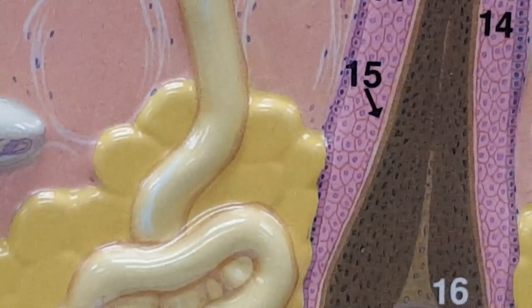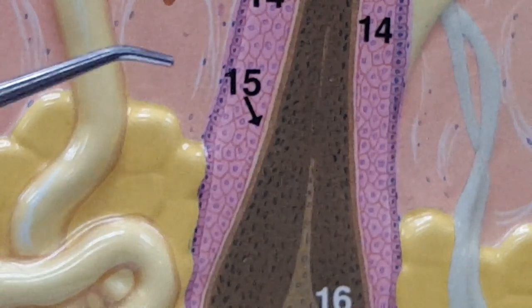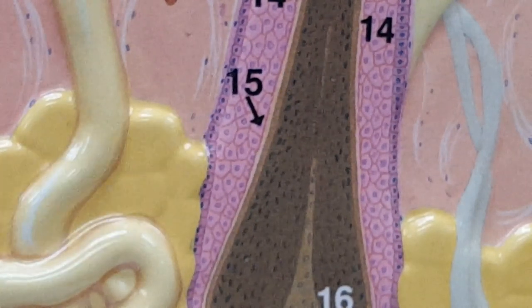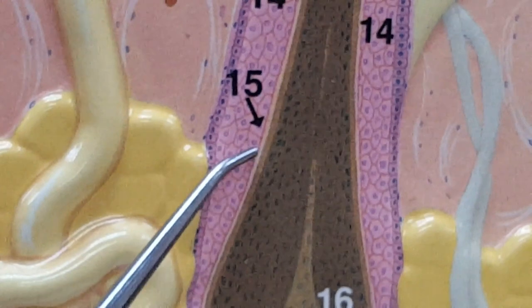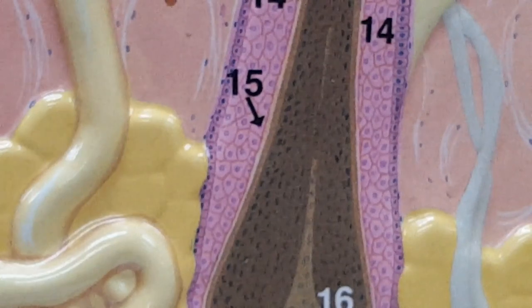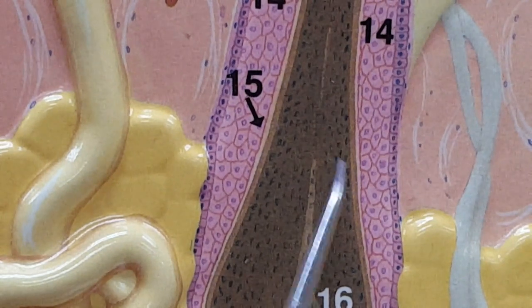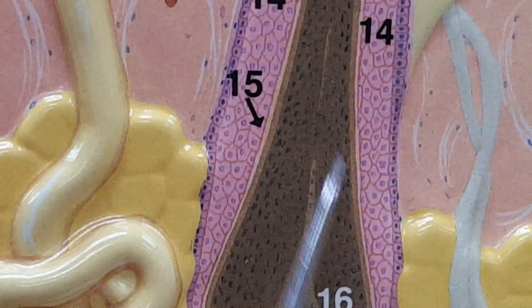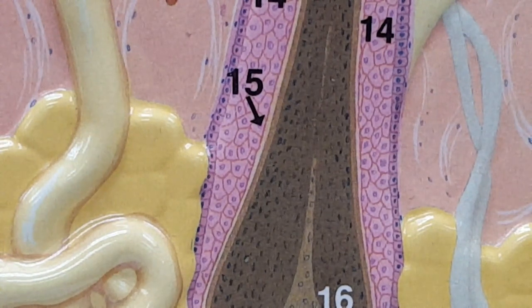Let me try to do even a little better photography work for you, if I can. Dermal is darker right there. Dermal, external, internal. Did everybody see that? I can see the medulla, the cortex, and then the darker tan line is the cuticle. Lighter tan line, you can see, is the internal root sheath.